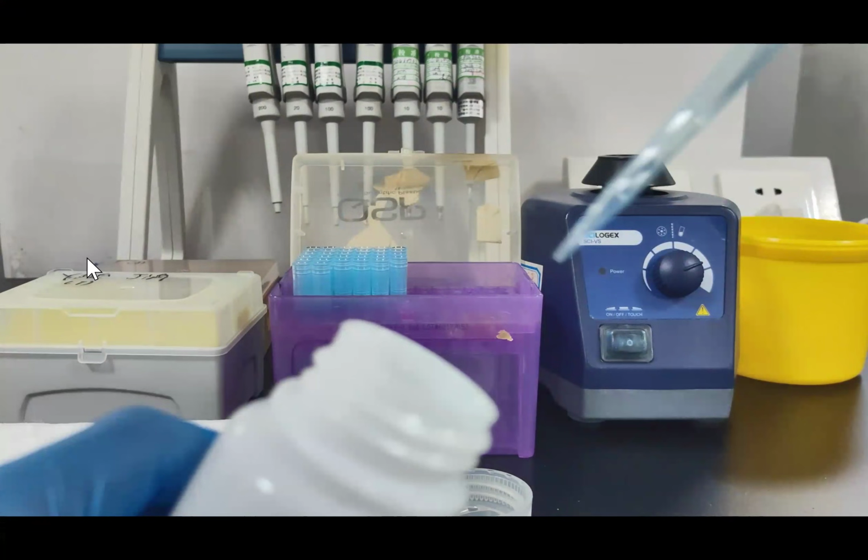I'd like to point out here that in this video we used different kinds of pipettes. In the customer's lab, they may not have so many types of pipettes. The principle is that you can see the instructions of the test reagents.